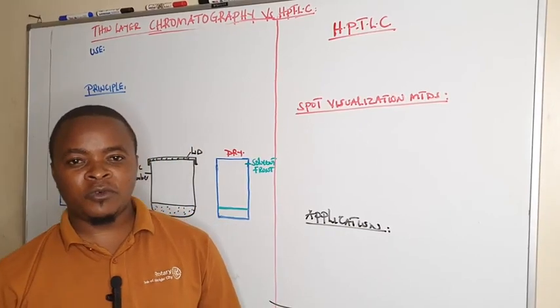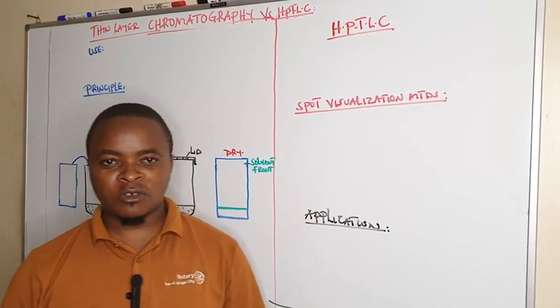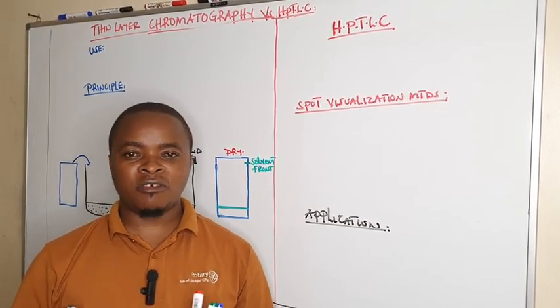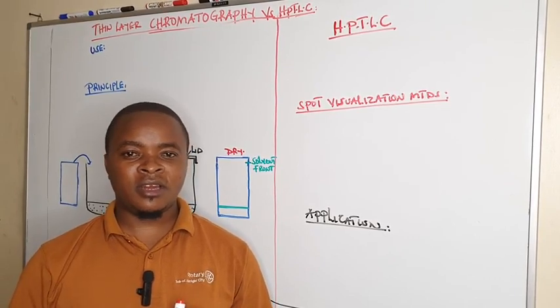In today's video, we want to dive into thin layer chromatography. So we are going to see the comparison between thin layer chromatography versus high performance thin layer chromatography.